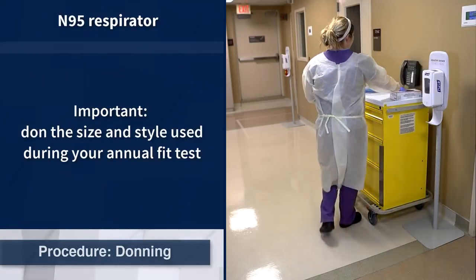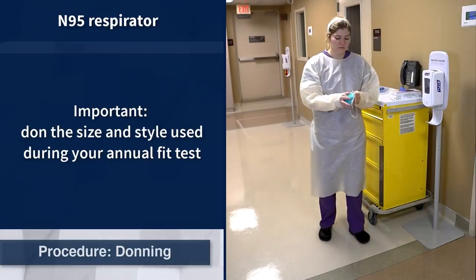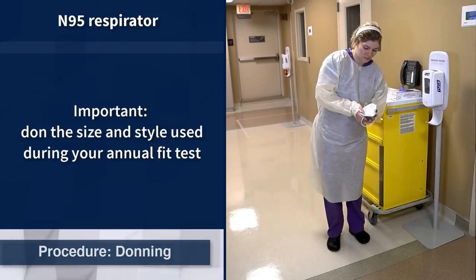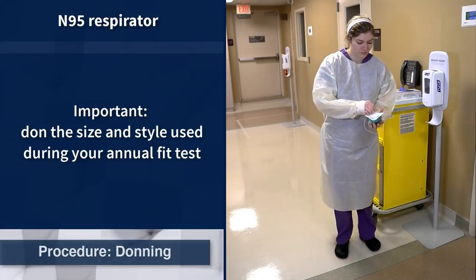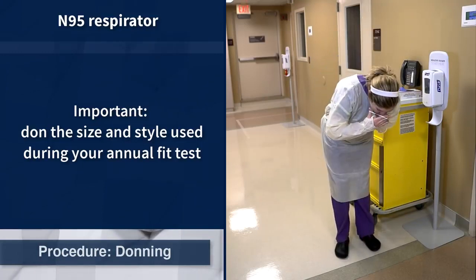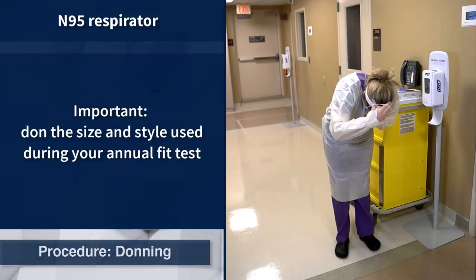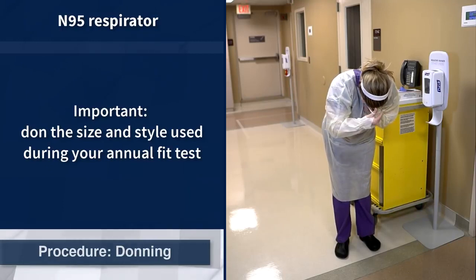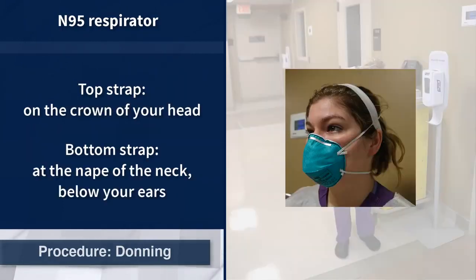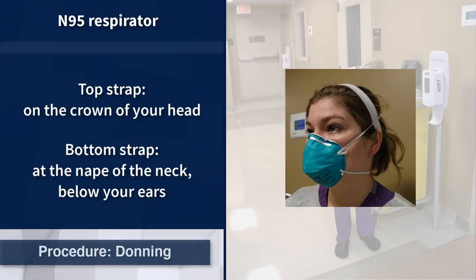After donning the isolation gown, put on the N95 respirator. Because N95 respirators come in various sizes and styles, it is important that staff use the same size and style of N95 respirator that they did during annual fit testing. For proper placement, N95 respirators must fit close to the face. This fit can be affected by facial hair or jewelry.